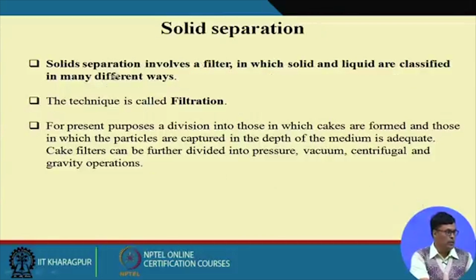Now solid separation involves the filter, in which the solid-liquid separations are classified in many different ways. The technique is called filtration. For present purposes, a division into those in which cakes are formed and those in which the particles are captured in the depth of the media is adequate.